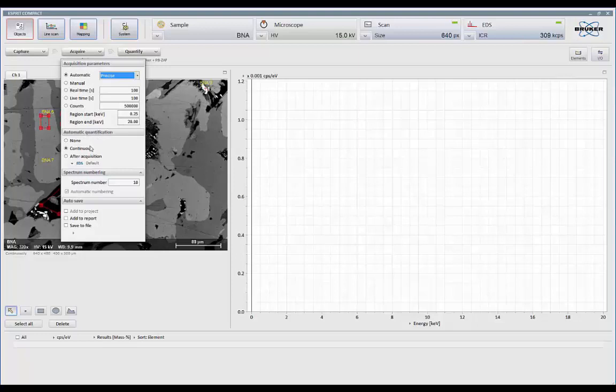You can add what we call an automated quantification or analysis. And what this will do is, while it's collecting the spectrum, or after your choice, you can have it do an auto ID, quantification, just quant on a fixed list of elements, whatever you want.